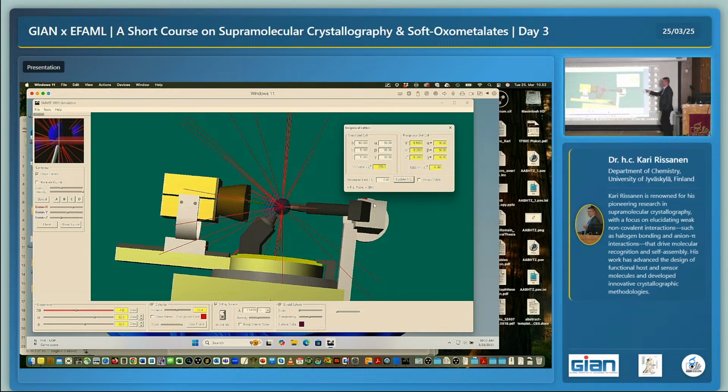And now you can see what happens here. Nothing is moved, but you can see the red reflections, the number of them is increasing all the time because we will have more of the points here. And more points will hit the surface of the Ewald sphere. Okay, let's do it again. Let's change this. Let's double that. Now, based on this, we should see double the amount of reflections. And now we have 4085. So now increasing the unit cell, but keeping the resolution the same, of course, we will have more of these planes in there.